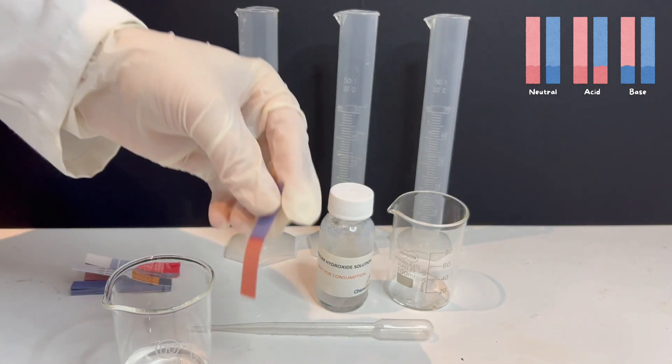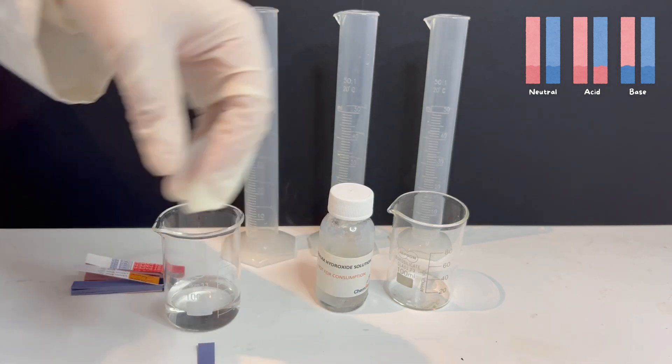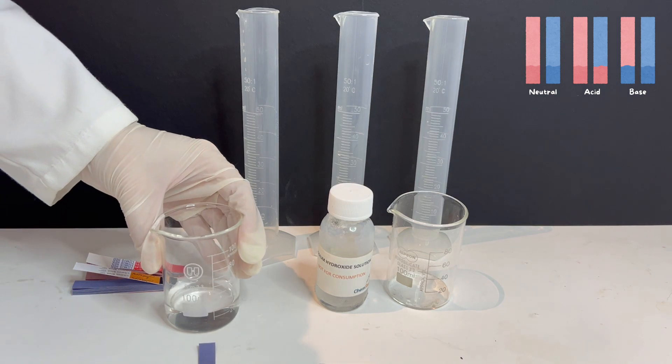The color change happens because acids increase the concentration of hydrogen ions in the solution and these ions cause the blue dye in the litmus paper to turn red.